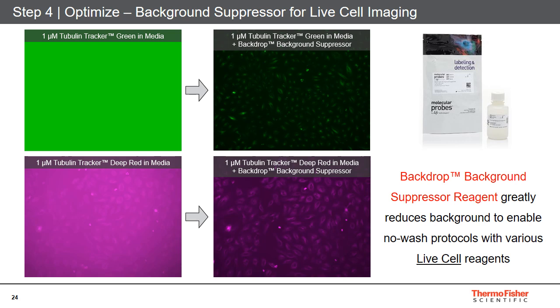In the event that the cell membrane is in any way compromised, whether due to cell death or due to some type of fixation or permeabilization workflow, the quencher will get inside the cells and it will quench all signal equally, inside and out. So it is only for live cell imaging.